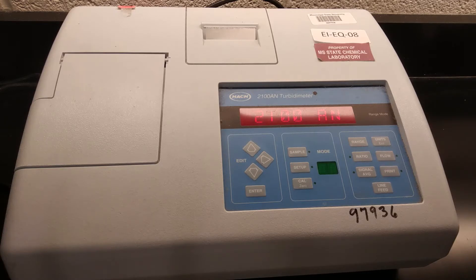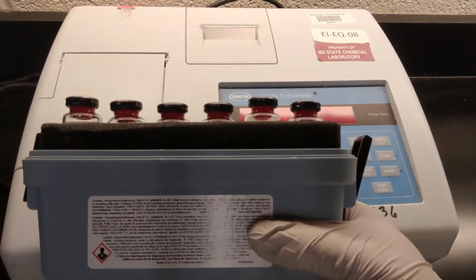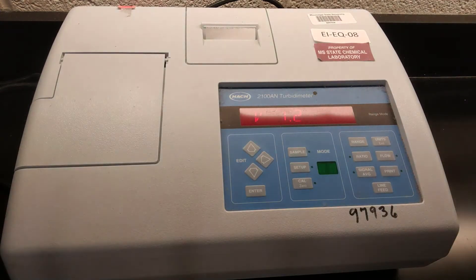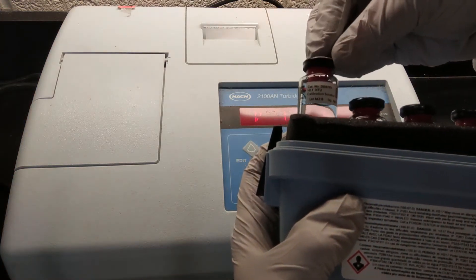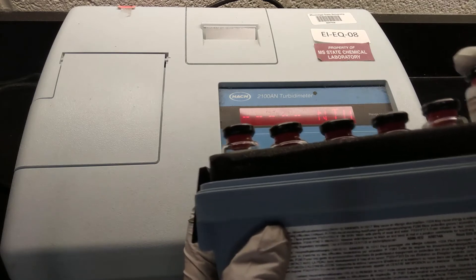So while we're waiting for that, we can go into what we're going to do once it does start up. A lot like basically every other analysis we do in this lab, we can't just put a sample into it and measure our turbidity. We're first going to have to do our calibration. And so that's where these guys come in. We're going to have to do our six point calibration starting with our lowest, our less than 0.1 NTU solution and ending at our highest, 7500.